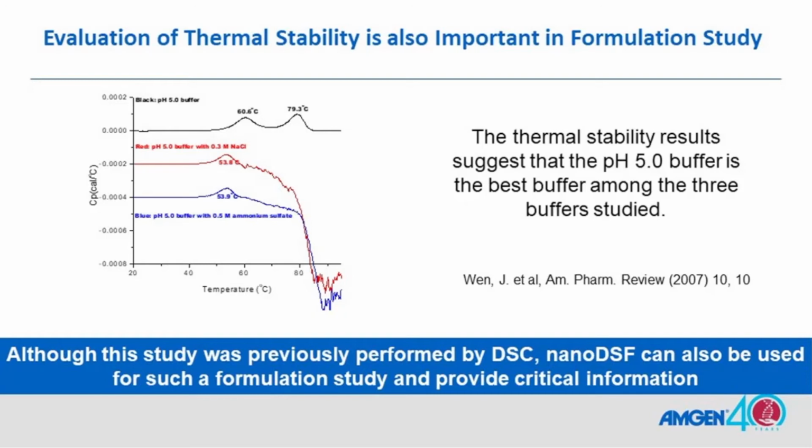So from this figure, you can see pH 5.0 buffer is the best among the 3 buffers studied.